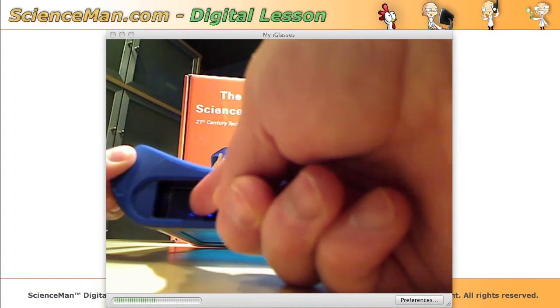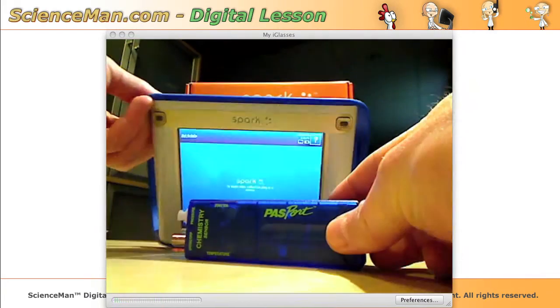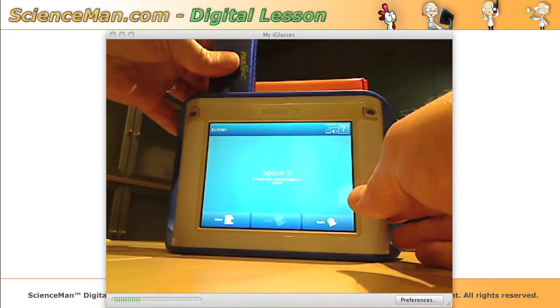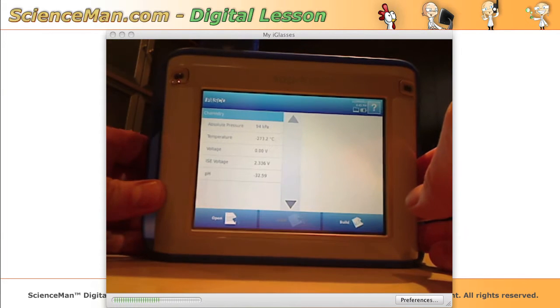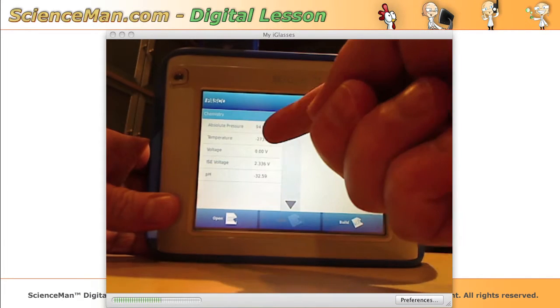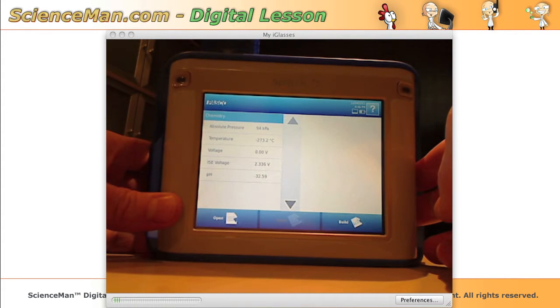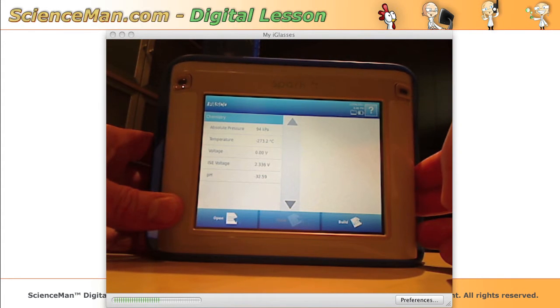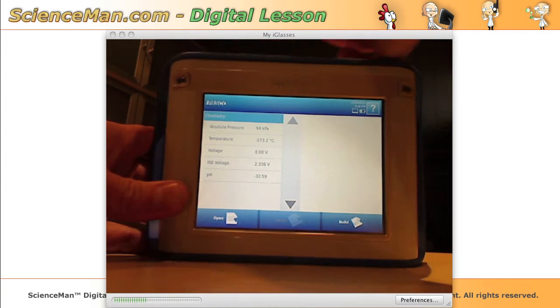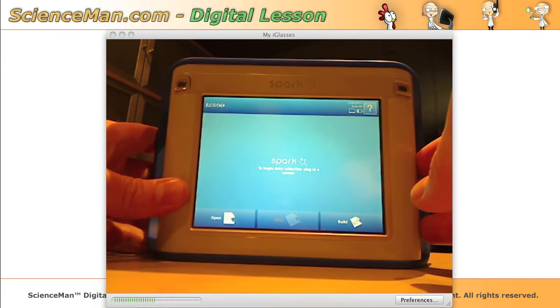We've also got two PASCO sensor ports. If you've seen these PASCO sensors before — you may even own some — they very easily plug into the SPARK system. Since I have the chemistry sensor plugged in, this is a multi-sensor that does absolute pressure, temperature, voltage, and pH, and they all show up on the screen. So we could be using that sensor to record many different things with our PASCO SPARK right now. If you just want to take a sensor out, you simply unplug it, and the SPARK is really good about sensing what's plugged into it.